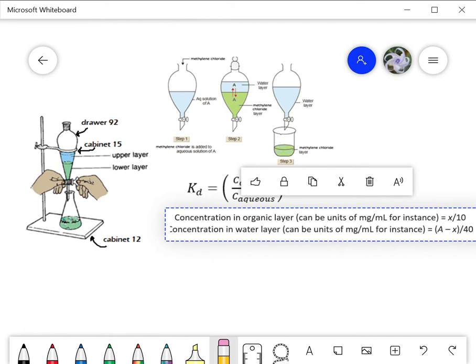This week we're going to do a partition coefficient in lab, so we need to visually see what's going on. If you follow along with this video you should have a much better feel for what lab is going to entail and some of the calculations. We're going to be using a separatory funnel for the very first time.